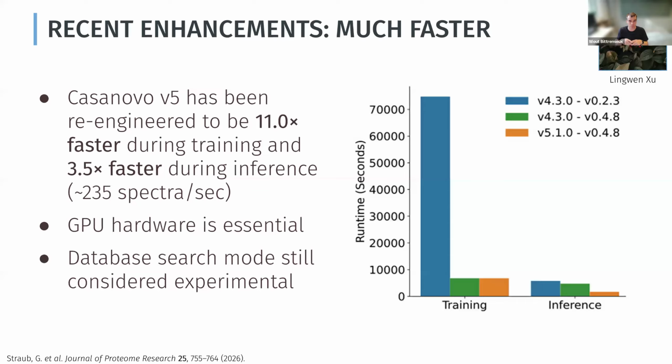And so it can be tricky to adapt architectures from natural language to our specific setting in mass spectrometry. That's where the creativity comes in, trying to figure out how we can best encode our mass spectral data in such a way that we can use it with these newly proposed architectures.